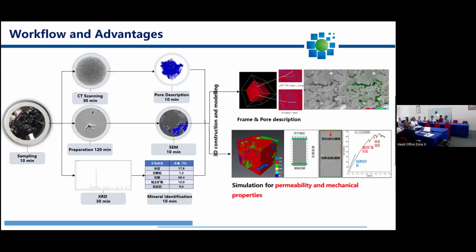The machine that you showed us before, the CT scan machine. Right, CT scan for core and cuttings. And also for sidewall core, we use the portable CT, because the sample is small, we talk core plug or sidewall core, to do the CT scan. We follow a similar process for cuttings.